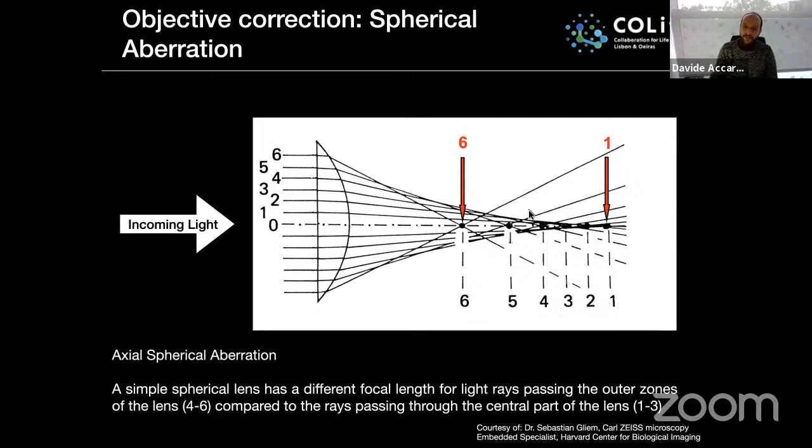Okay. This means that if you have a single object, which could be your fluorophore, for example your GFP molecule, or any point source of light that emits light in every direction, and the light is collected by the entire lens, then your single dimensionless, point source of light will actually create an image of an elongated object.